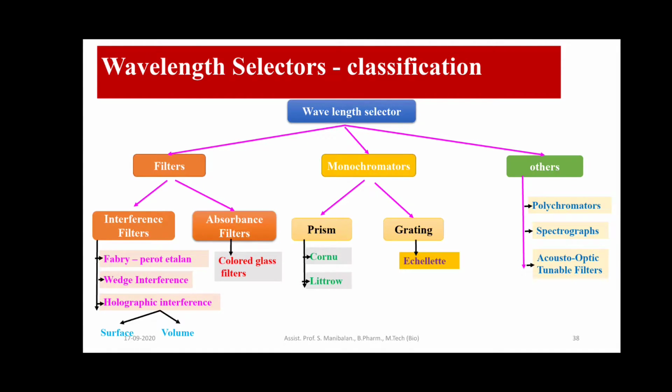In the lines, the light waves get reflected or transmitted and give the exact wavelength. The most important thing is that those lines are drawn using a diamond tool. We can make nearly 1000 to 3000 lines, done by automatic machines.